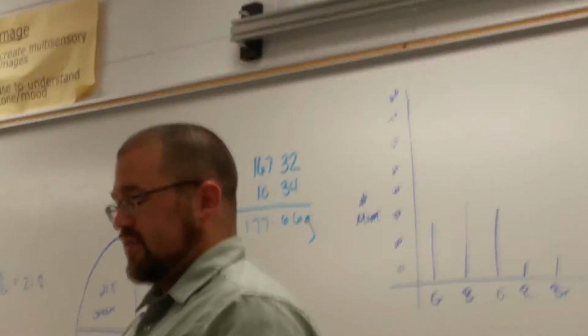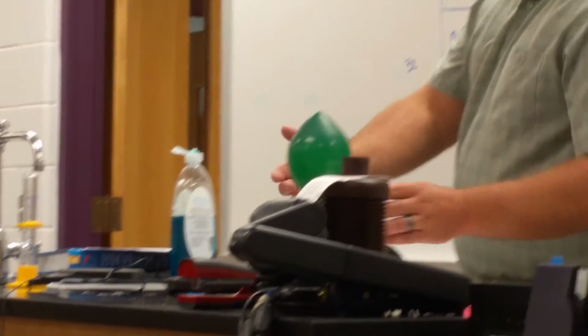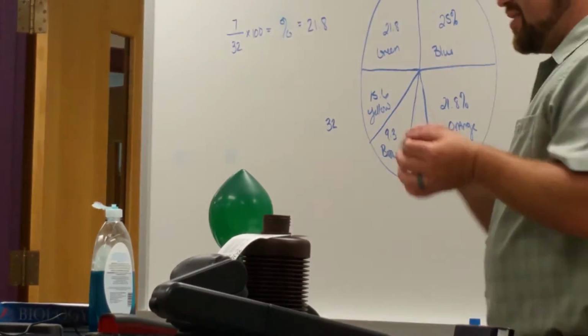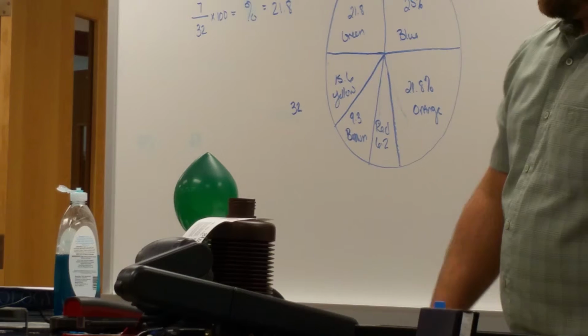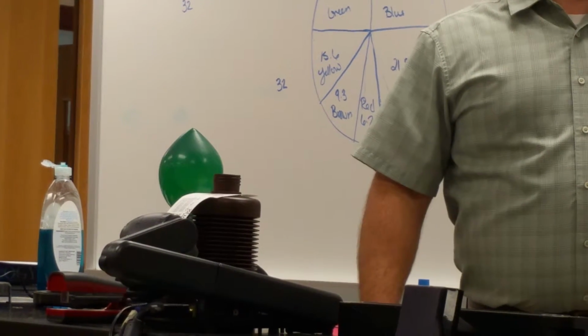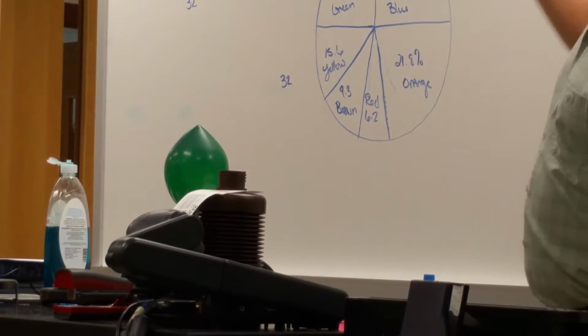So 177.59. Now, to be honest, you guys have used balances before. They're always slightly off or slightly errored. But we're way closer this way than we were the first way. Okay? Way closer this way than we were that way.